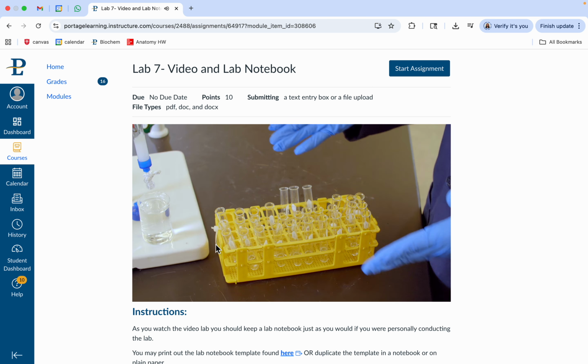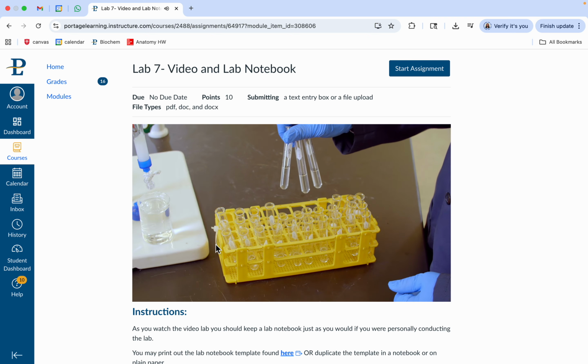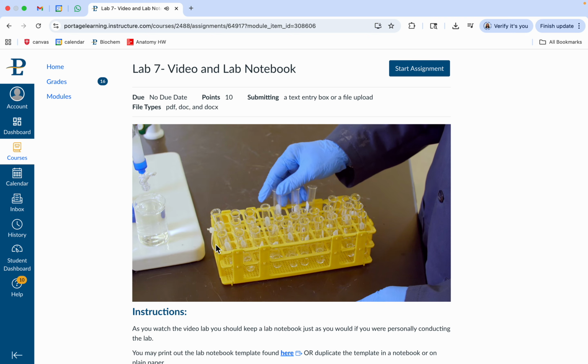So we finished our column, and we ran GOT quick assays on all of these. And what we found out was that 25, 26, and 27 are the best test tubes that have the highest concentration. All right, so we've done all 30 of these. We figured out 25, 26, and 27 really tend to be the best. So we're going to take those 3 and we're going to concentrate them and do our gel next.